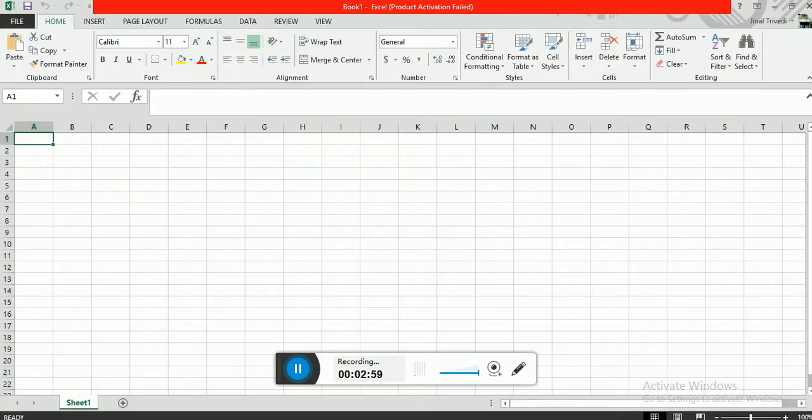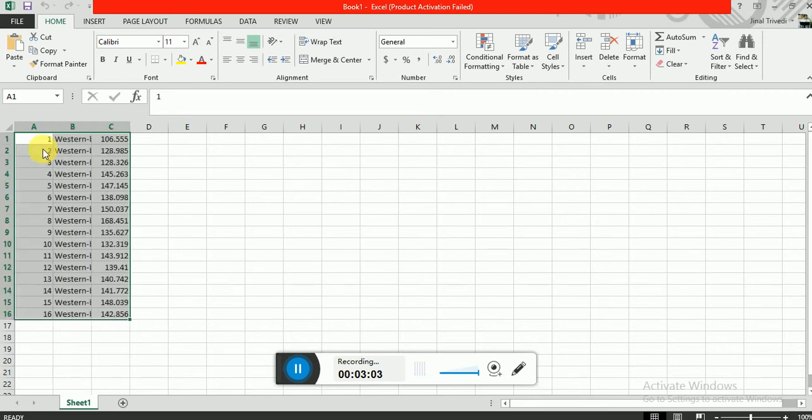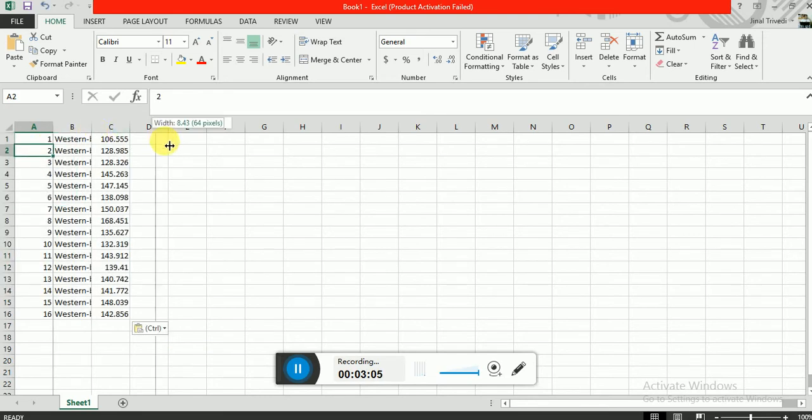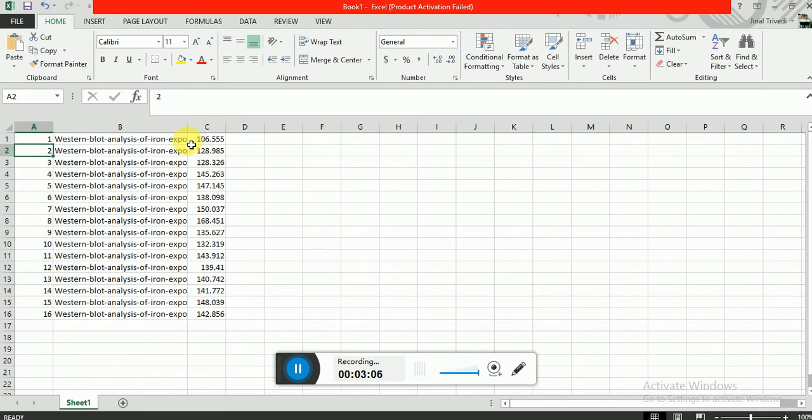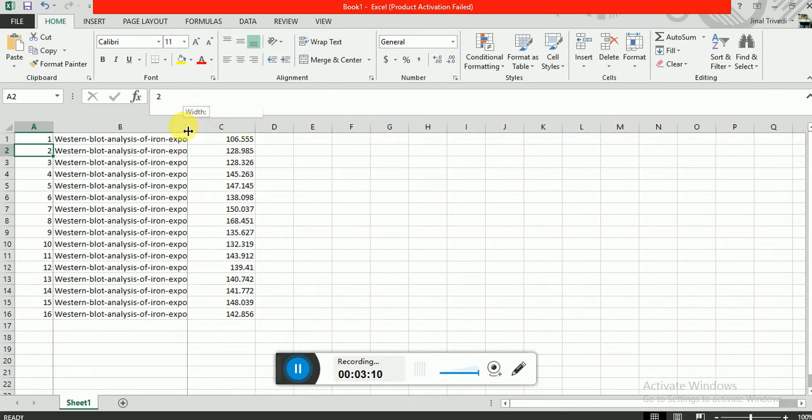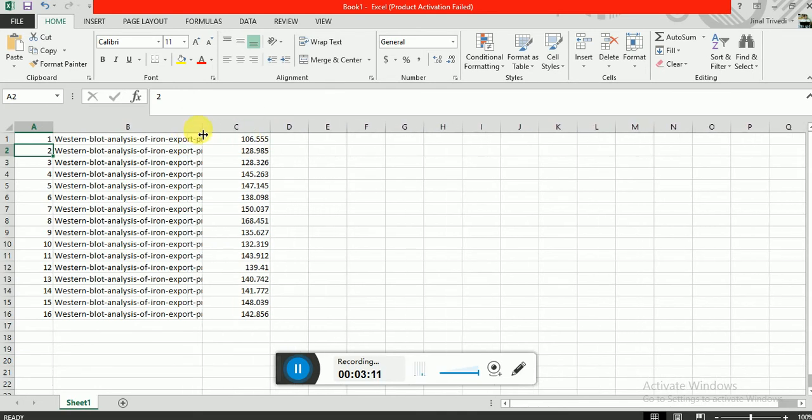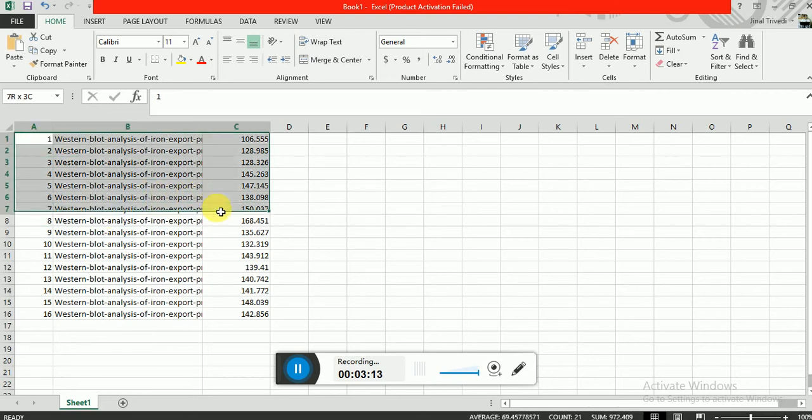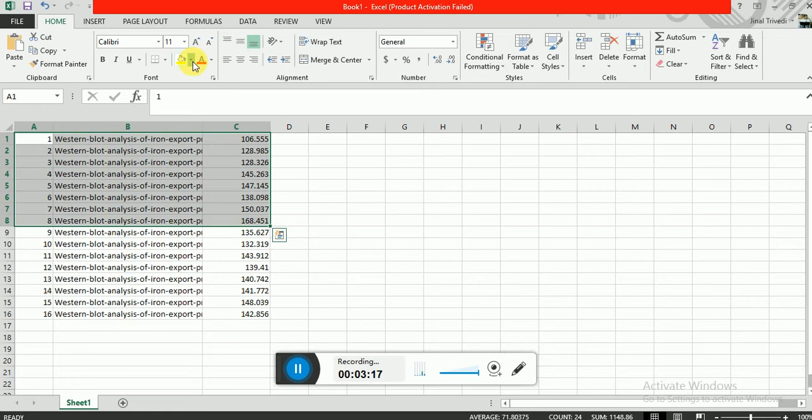So you will find the mean gray value. Now the first eight values are of your desired protein, so mark with any color, and this is beta-actin value.